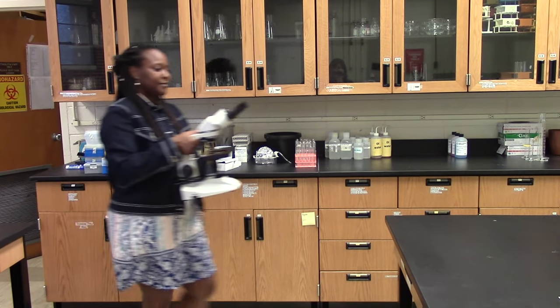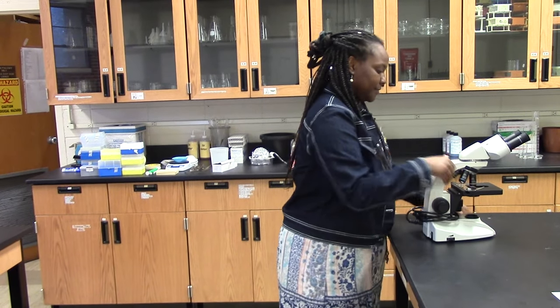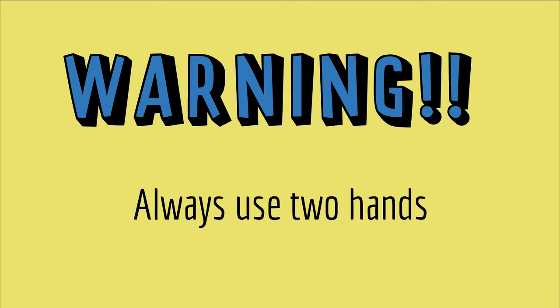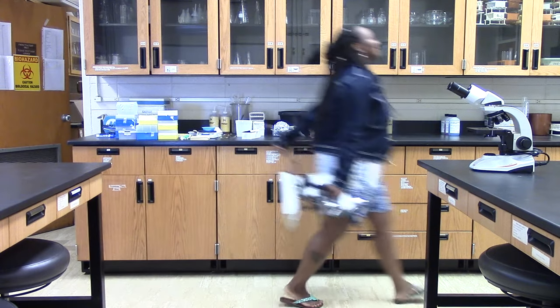If you need to move the microscope, carry it with two hands, holding one hand under the base and one hand on the arm, and place it gently on a flat surface. Never carry the microscope with one hand — always use two hands.